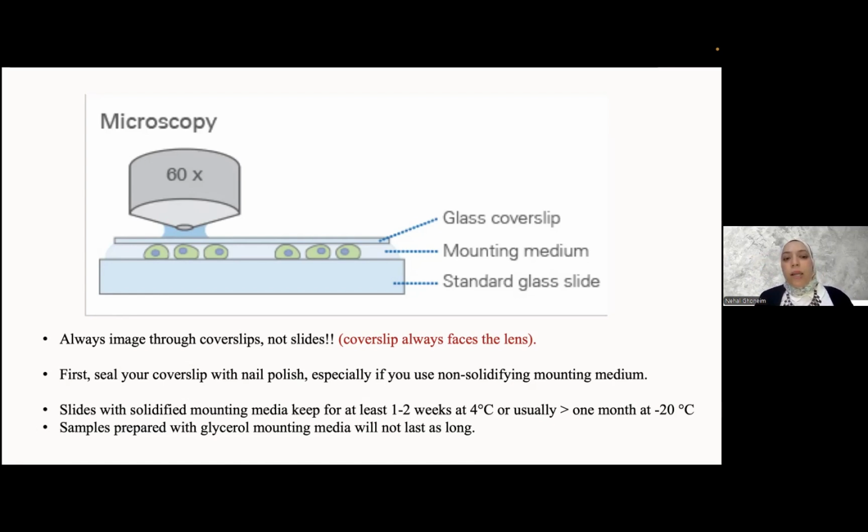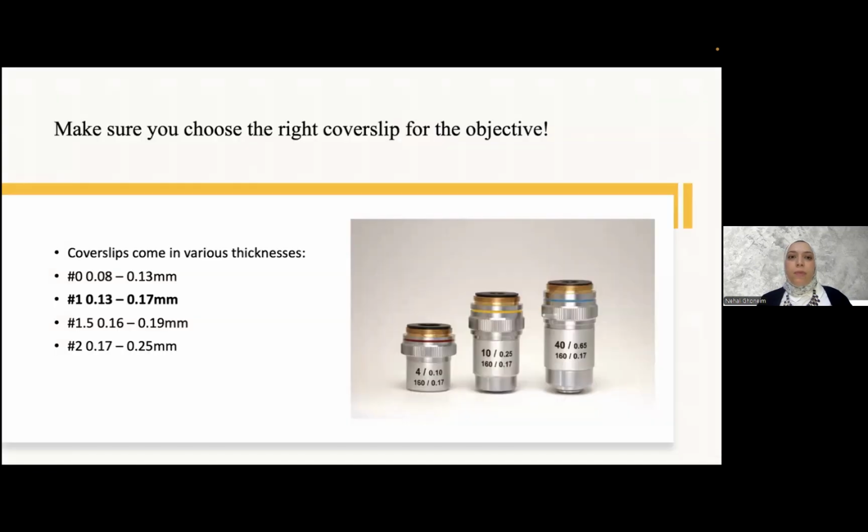Slides with solidified mounting medium can be kept for at least 1 to 2 weeks at 4 degrees. I usually keep them at 4 degrees for short term, and for 1 month at -20. Samples prepared with glycerol media will not last as long as the solidifying mounting media.